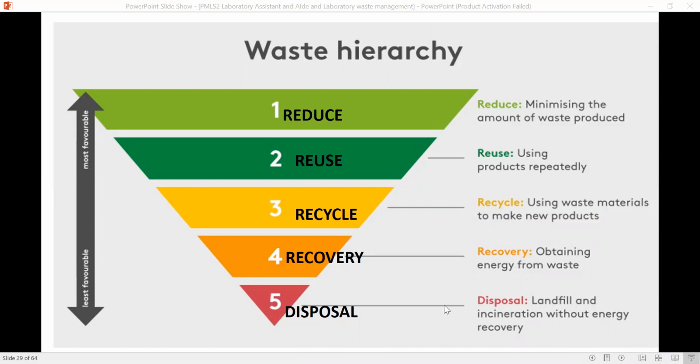And then the disposal. Last na will be the disposal. Ayaw nating magtapon. Usually, before disposal, kailangan i-treat muna yan. So later, we'll be discussing what are the methods of treatment before disposal, and how to dispose.